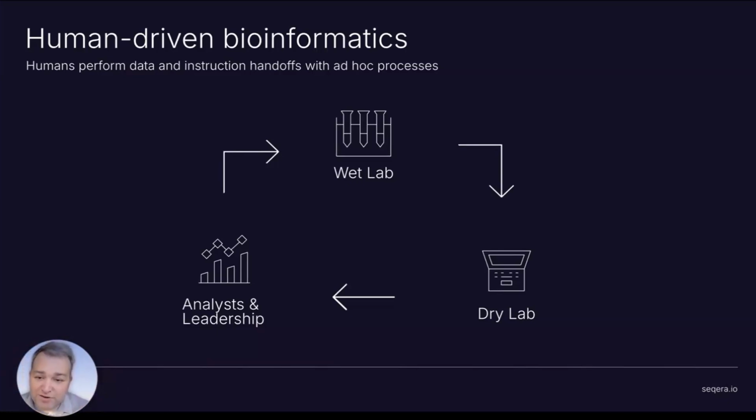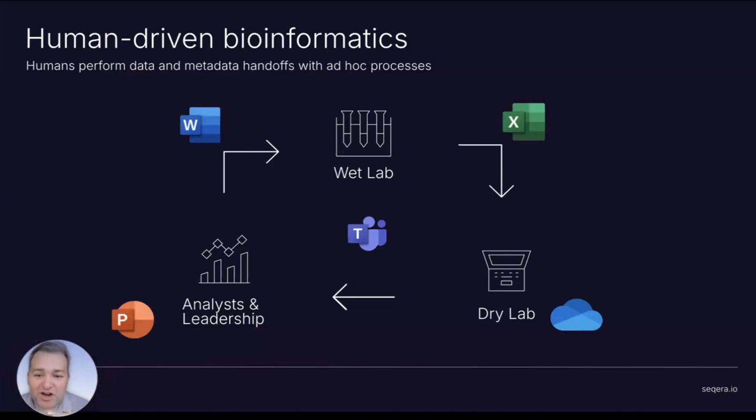In human-driven bioinformatics, people are the ones performing the data and instruction handoffs, largely with ad hoc processes and with a whole suite of different software tools. Here I've shown the Microsoft flavor of these processes, and I'm sure this will feel familiar to many of you, where perhaps the raw data comes out of the wet lab and then gets copied over into an Excel spreadsheet, and that's the thing that makes its way to the dry lab, perhaps via being uploaded to OneDrive.